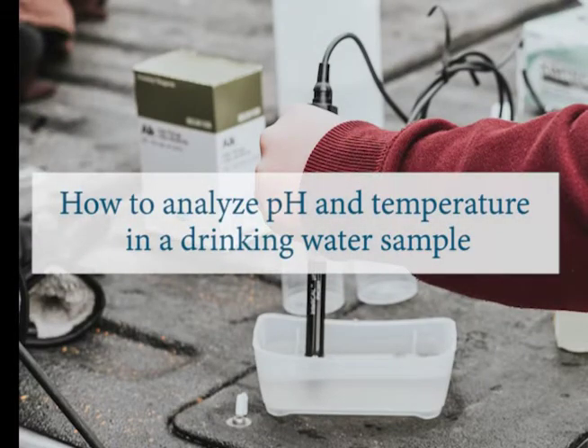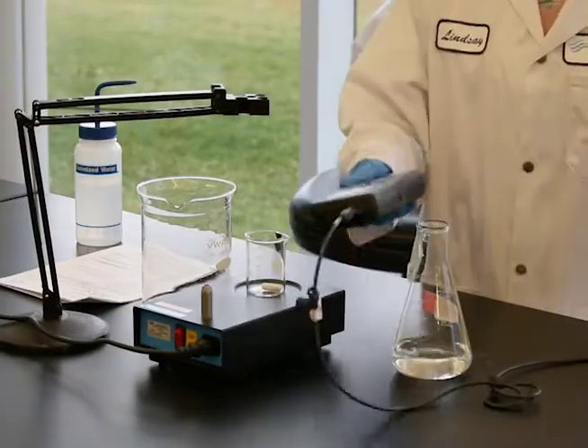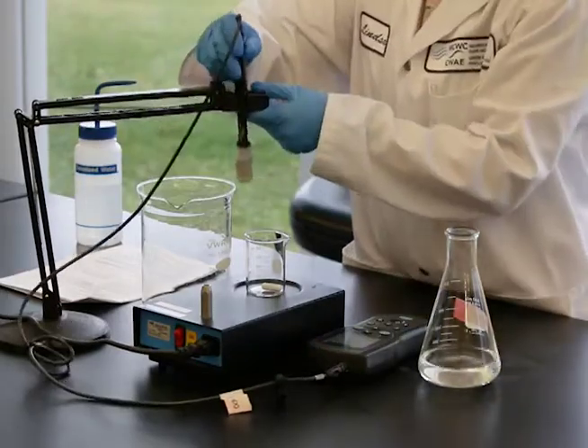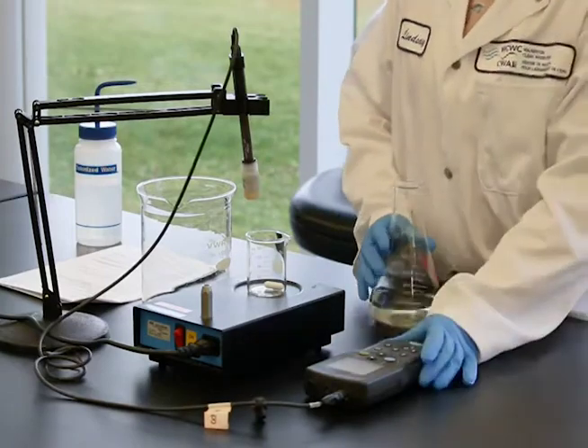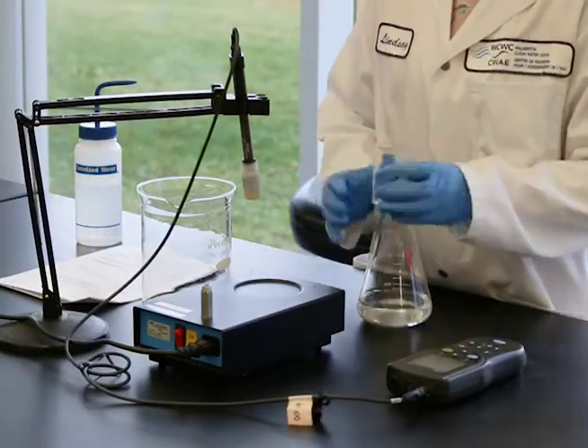pH, which stands for potential of hydrogen, is the hydrogen ion activity in a solution. The electrode develops a potential at the glass-liquid interface. This video will demonstrate how to properly analyze the pH and temperature of a drinking water sample using the US EPA electrode method.